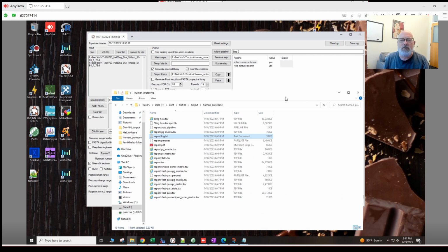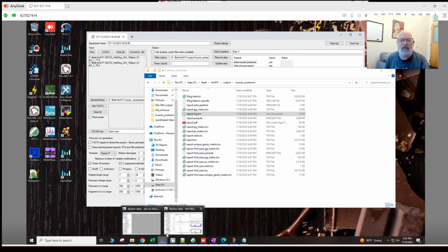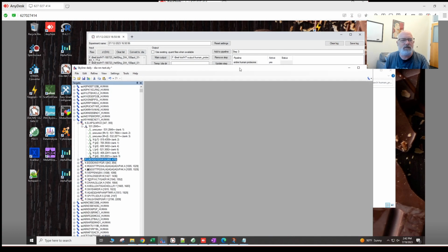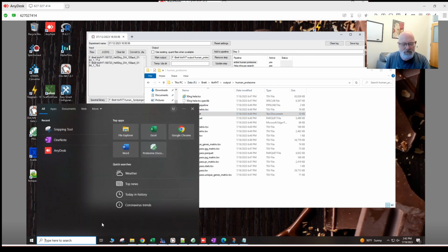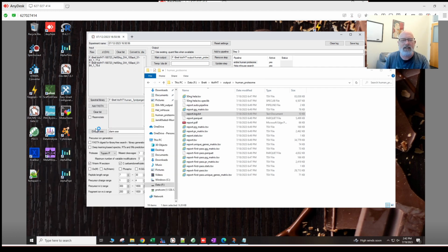Okay, so what files do we need for Skyline? The first thing we're going to do is open Skyline daily, and we'll open a new one. I have a couple instances open.